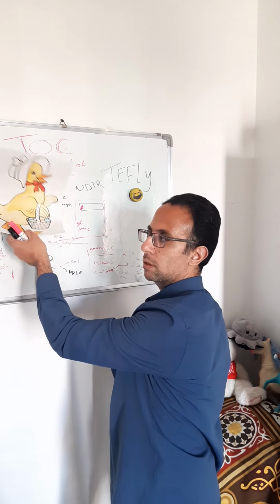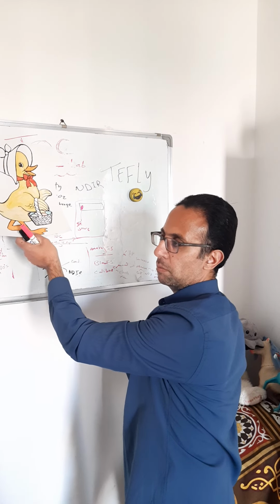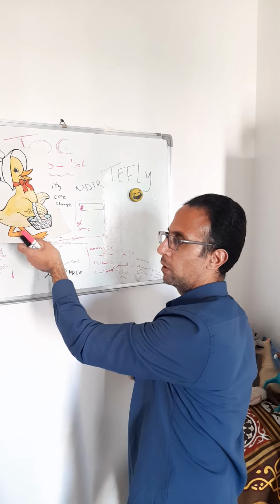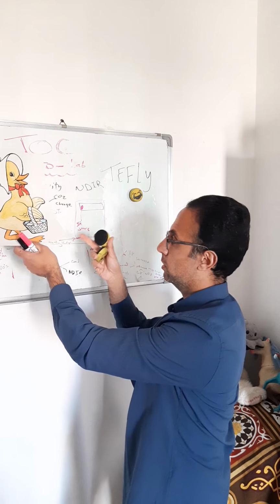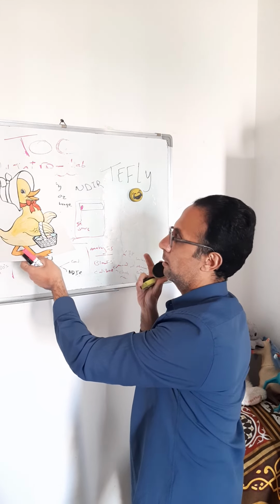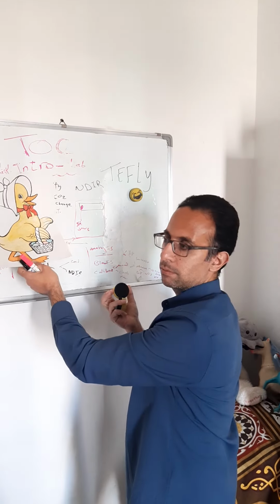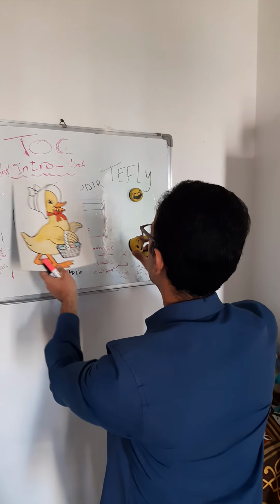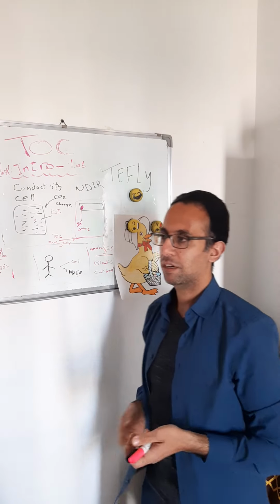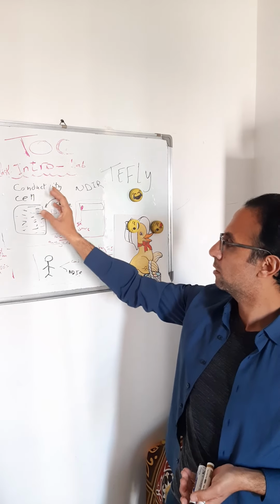Can you expect? We said no flame. Spectrum we already said, like MS, electron beam. It's similar to spectrum, no. Actually something different, and this is actually a unique feature of TOC. I like this instrument because it contains technology and simplicity at the same time. So the other way is a conductivity cell, something like pH, conductivity, TDS. Yes, the detector is a conductivity cell.